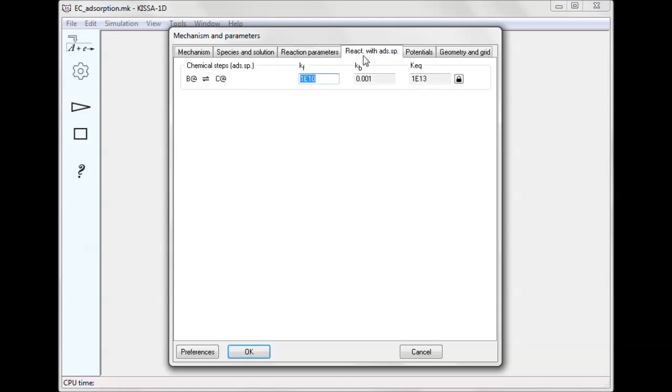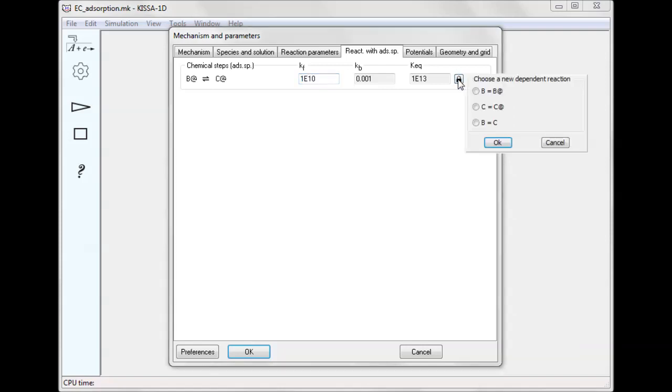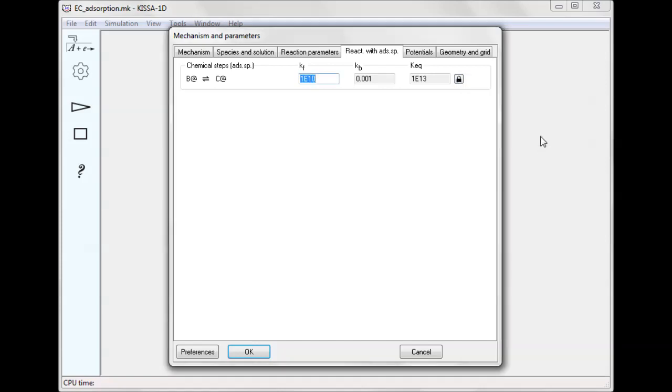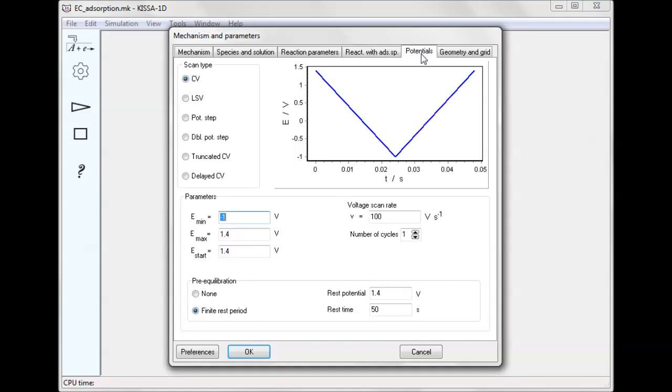The parameters of the chemical step in the adsorbed state appear on the next step. This reaction is also thermodynamically dependent, and its equilibrium constant cannot be changed directly.